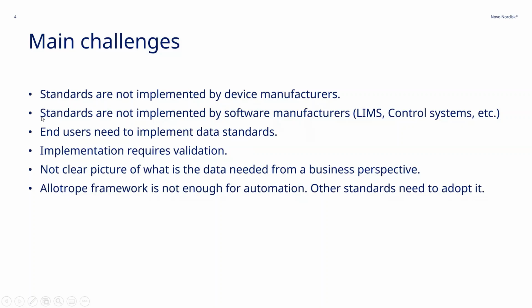We use a control system that is developed by a company called BioZero. That is just to control the work cell. And of course, there's no out-of-the-box way to handle a response or the data as it comes from an Allotrope model, but no one does that anywhere. So this is kind of an advantage and a disadvantage at the same time. Let's just say it like that.